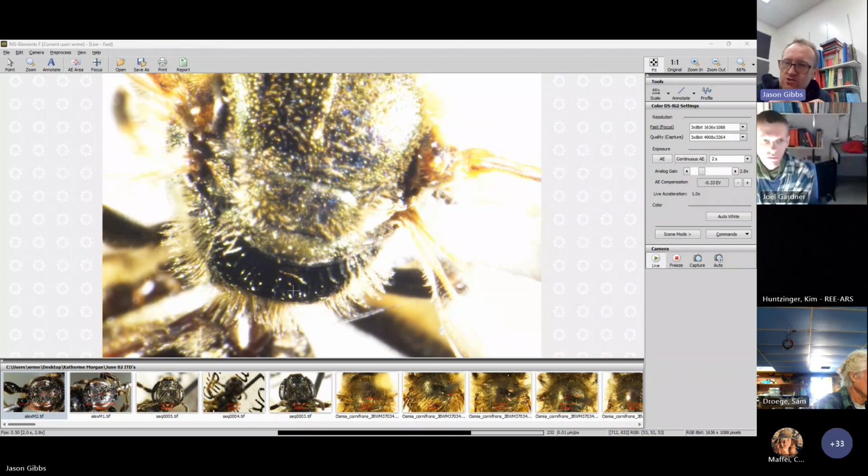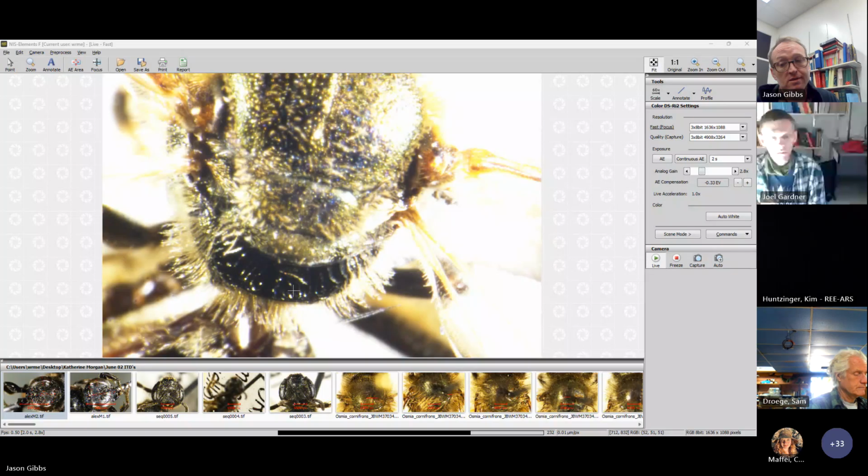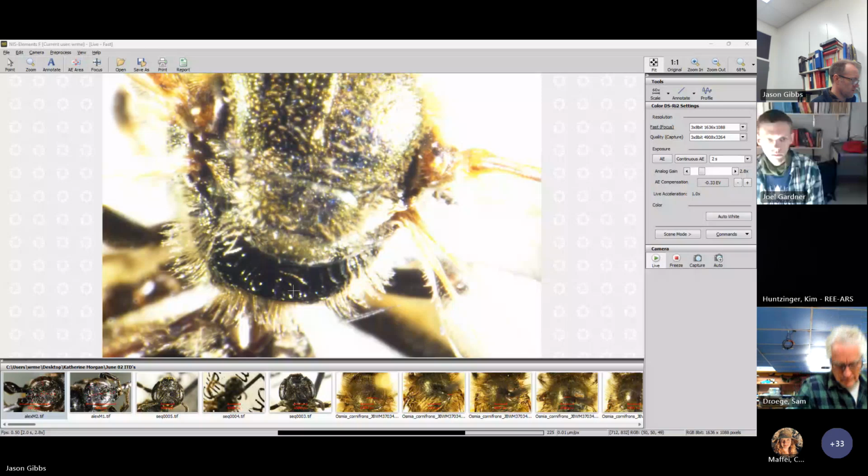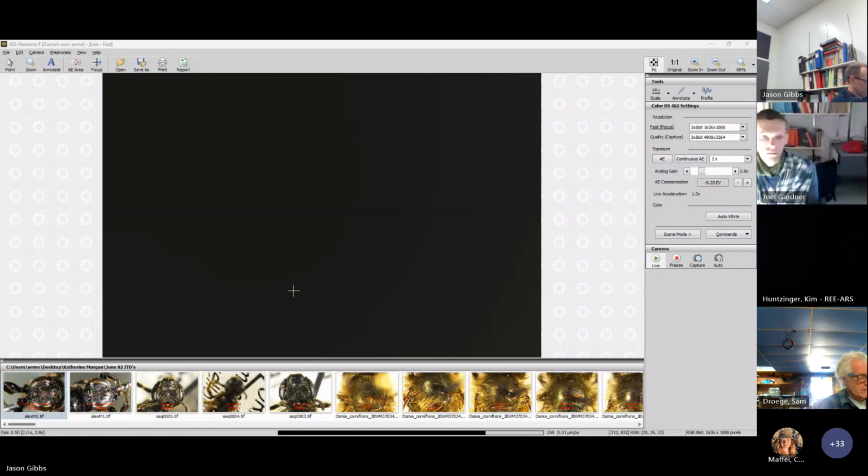The trochanters are maybe a little wider than they should be. If you looked at it, you might think this is a worker callidum, but the DNA evidence suggests that they're not the same. So I will try to find them. They tend to be quite a bit smaller than versatum, and often bluer, I would say.